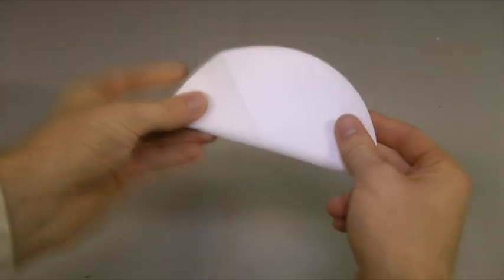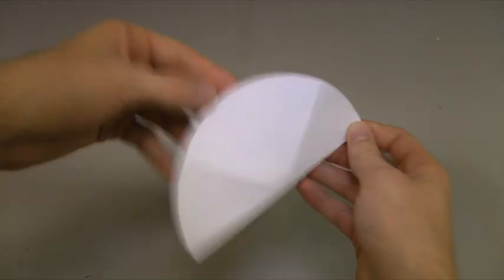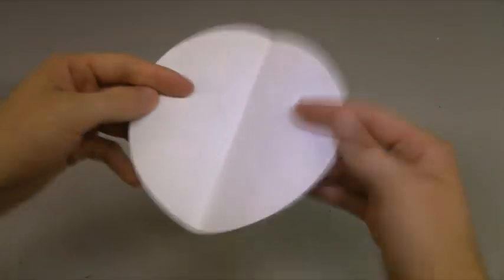You then need to add two further folds in the same direction so that the four folds divide the filter paper into eight segments.